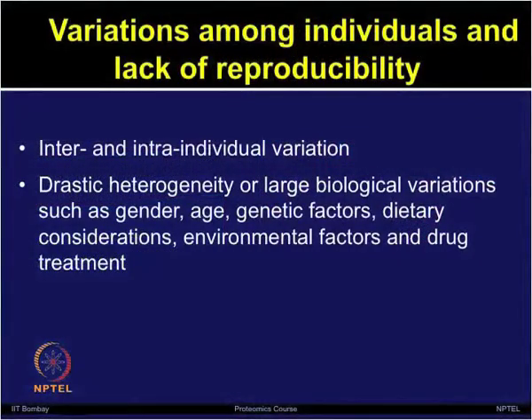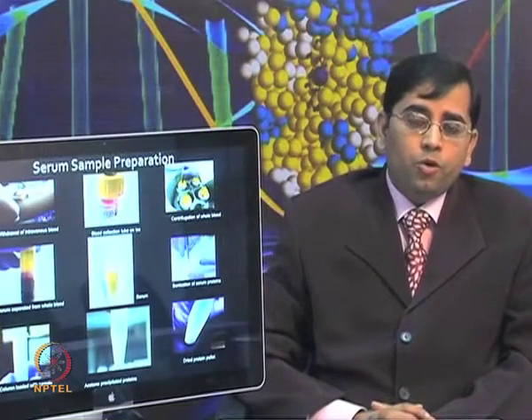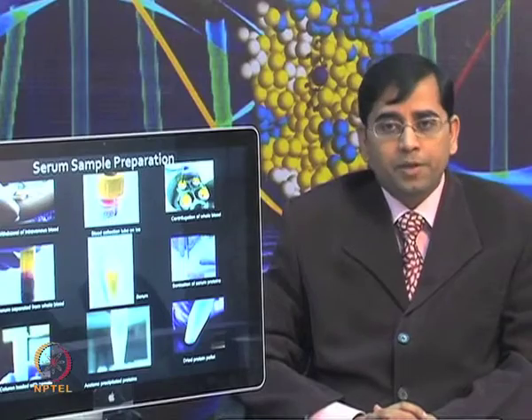The drastic heterogeneity or large biological variations, such as gender, age, genetic factors, dietary considerations, environmental factors and drug treatments, are going to affect the reproducibility of your experiments. So, if you are careful in designing the experiment, one can at least minimize these variations and increase the reproducibility of the proteome analysis.